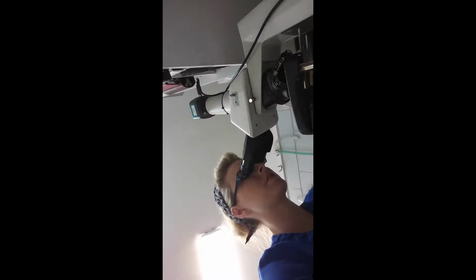This was on a dog that's been spayed for a while, so we should expect to see just really some epithelial cells, which is really all I've seen so far, or random yeast. Not even seeing a white blood cell. Some keratinized epithelial cells, and it's really about all I'm seeing. Which is perfectly normal for a spayed female dog. So it's normal that it's not too terribly exciting of a cytology.